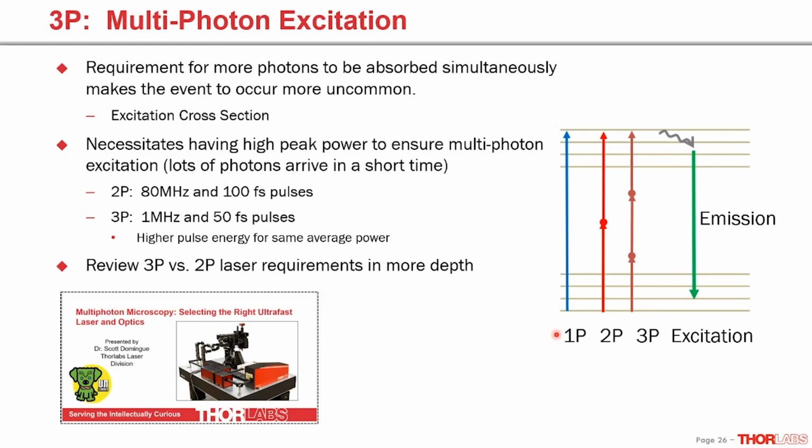If we look here to the right, if anyone has shone light into a fluorescein sample, you get one-photon excitation, and you can see emission coming from throughout the whole sample. This is why when you do confocal microscopy, you need a pinhole to get optimal sectioning. Using 2-photon, a nonlinear process, you can remove the necessity for a pinhole, because the likelihood for this to occur only happens when a lot of photons arrive in a short period of time.